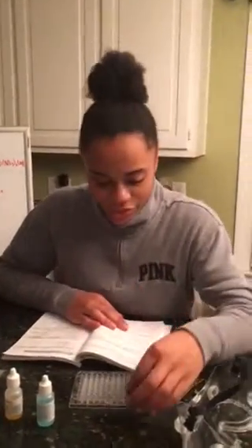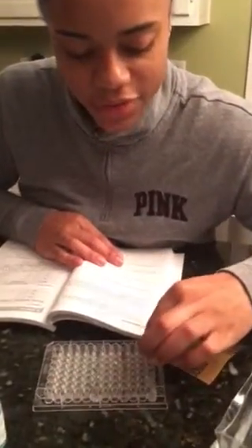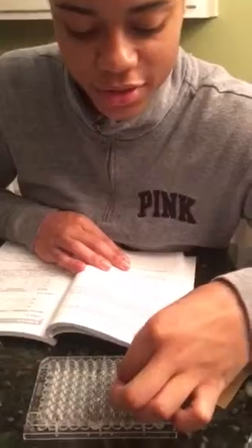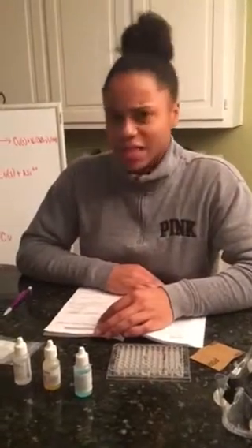So I'll be showing those to you. You can see a slight bit of oxidation. You can really see it for this one. That is the zinc that reacted with the copper nitrate. And that is also the zinc that reacted with the iron nitrate. So those were the two biggest reactions. So nothing really reacted with the zinc nitrate.